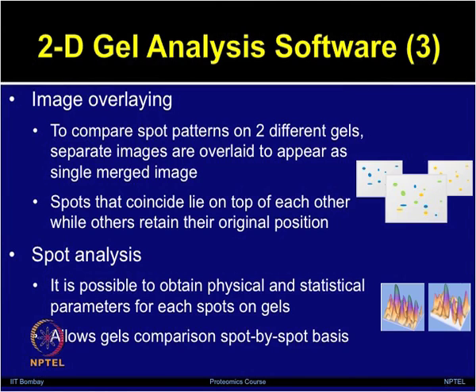So, often running a gel or acquiring images and generating a lot of data is much more straightforward as compared to doing the analysis, which is a more tedious step. One has to really sit and go through the gels, usually spot by spot, to analyze them.